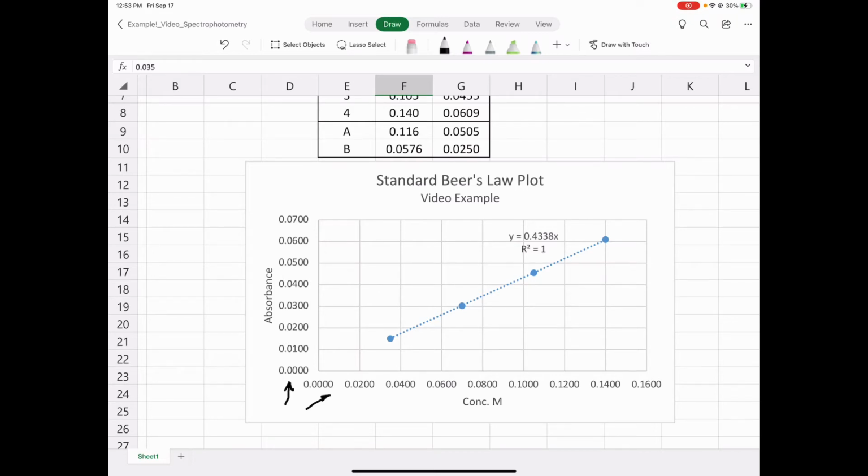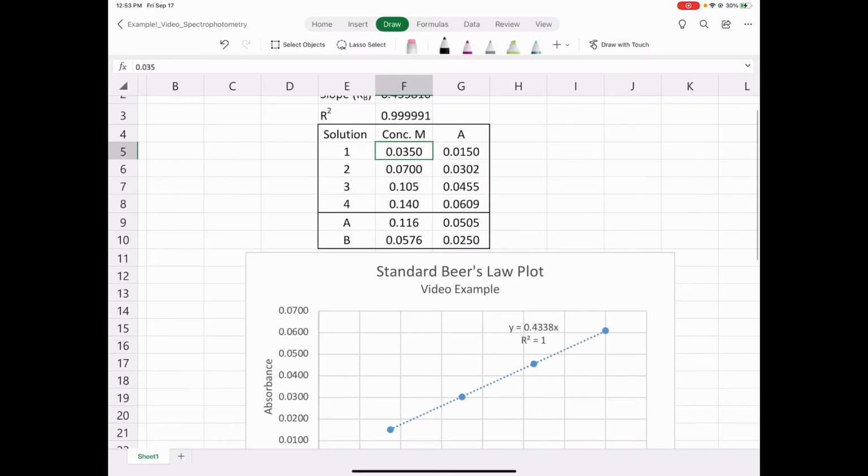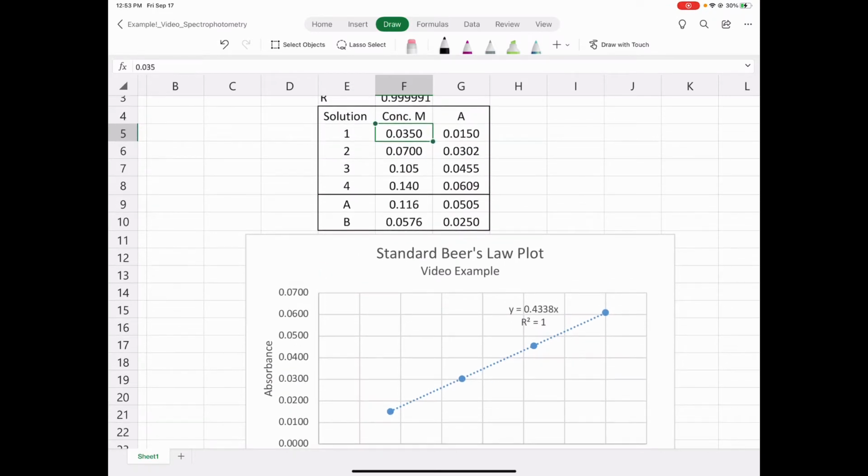It's hard to fix in Excel, but when you go past the 0.08 mark, these zeros really are not significant. You can't do anything about it in Excel; you just have to accept it. But know that if you're predicting values for the ranges shown, you have to limit yourself to the precision of the values that you found based on the experiments.